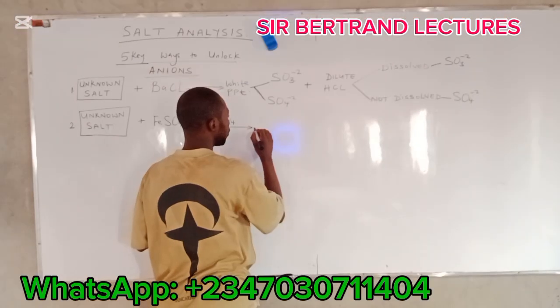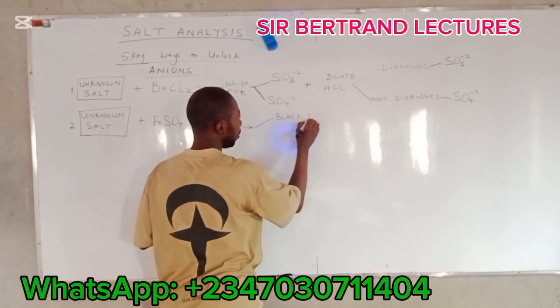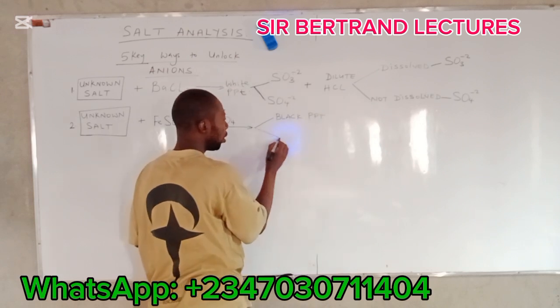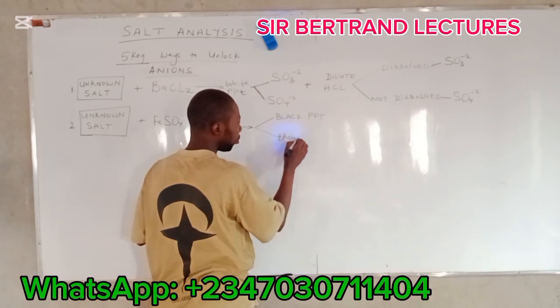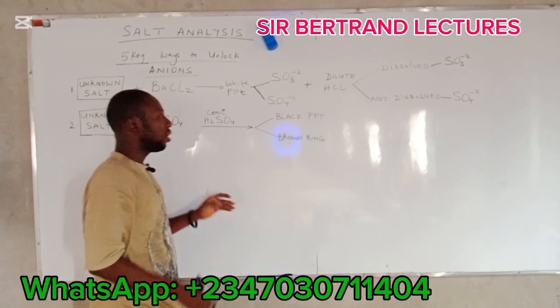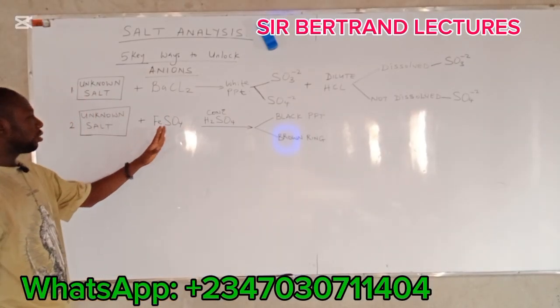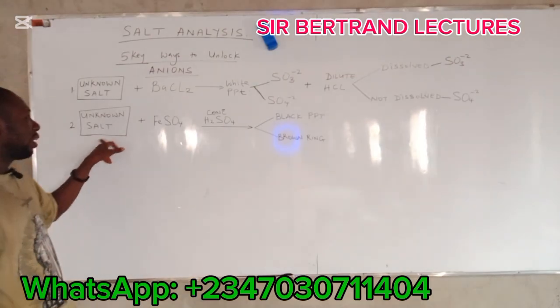It gives black precipitate or it gives brown ring.